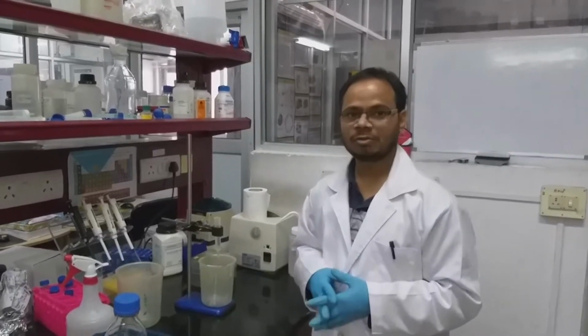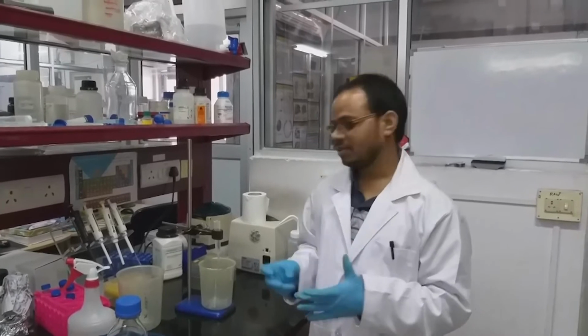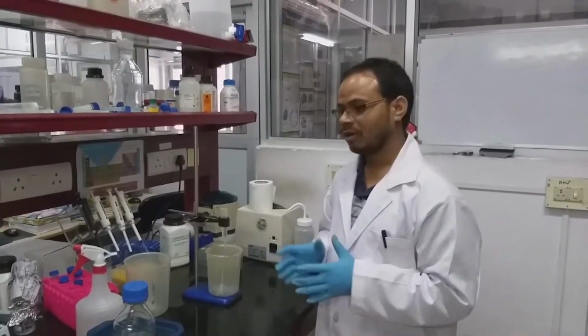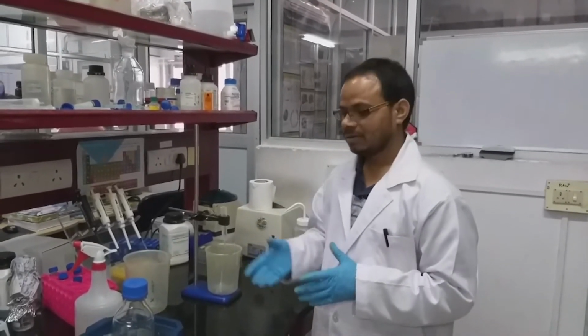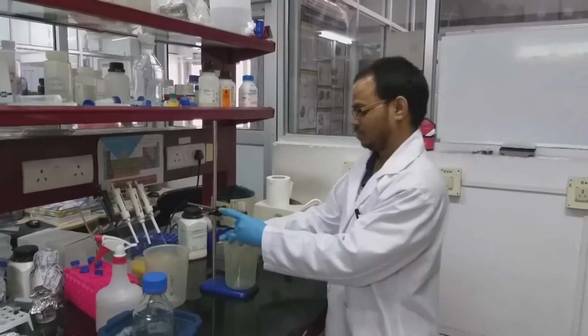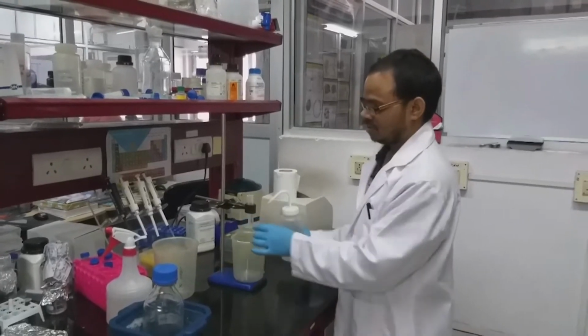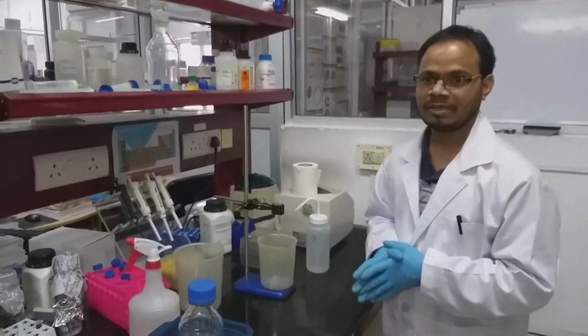While the centrifugation is going on, we have to wash the column, which is in 20% ethanol. We have to wash first with water, then equilibration buffer. Let it drain completely, that 20% ethanol.